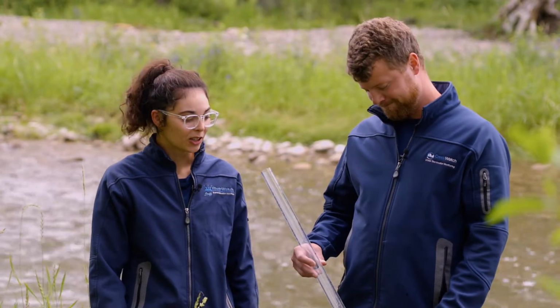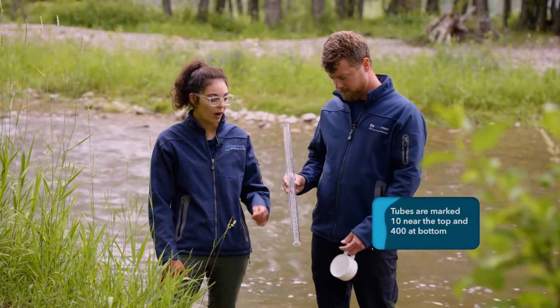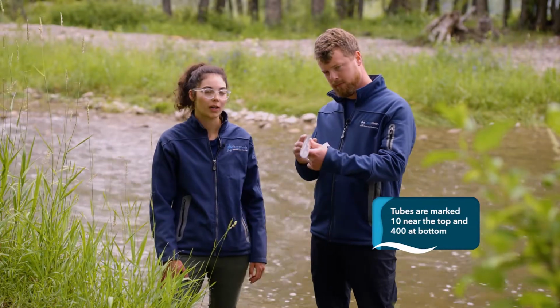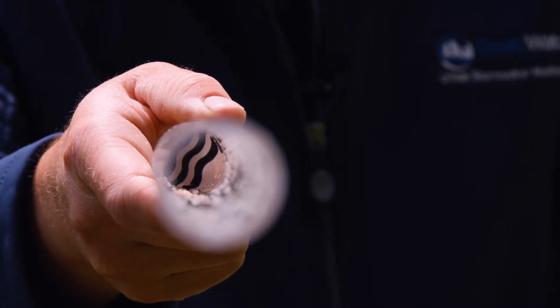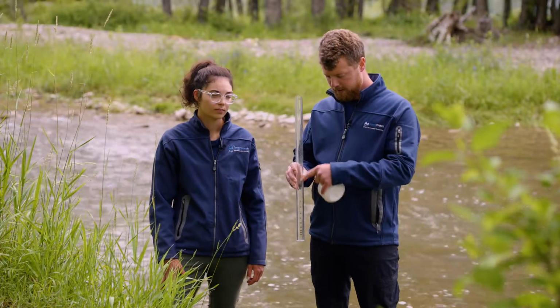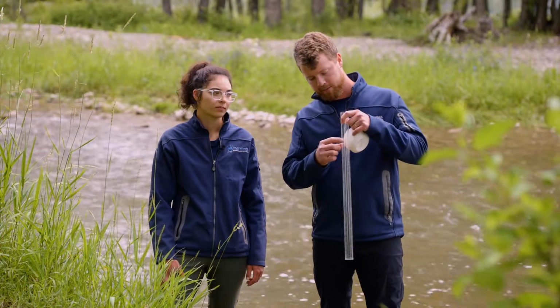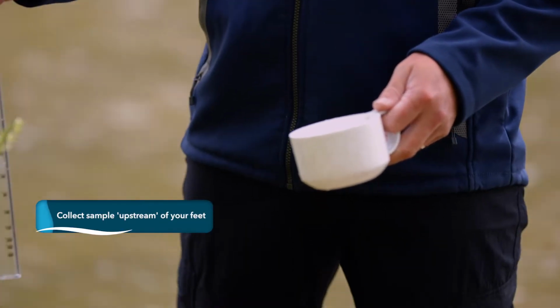That's fair. So we are going to be pouring water into our tube, and one really important aspect of our turbidity tube is the squiggles inside. Yeah, there's 3 squiggly lines at the bottom. Basically what we're going to be doing today, we're going to be using this cup to collect some water. We're going to be filling this tube up until the lines disappear down at the bottom. Once they disappear, that is the number that you're going to read on the side of the tube.